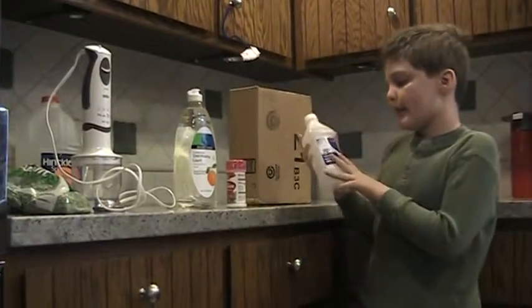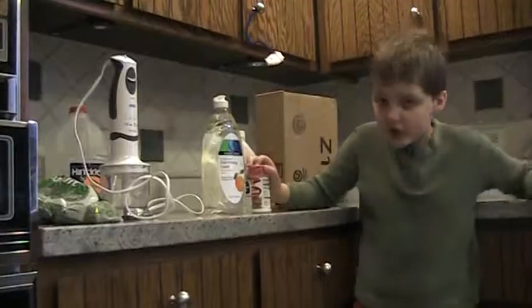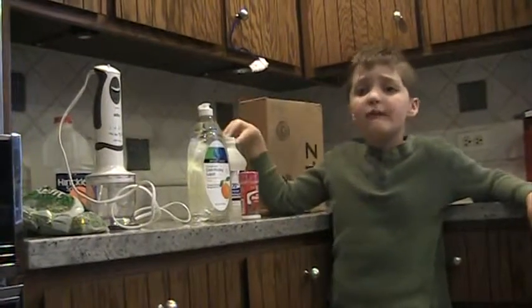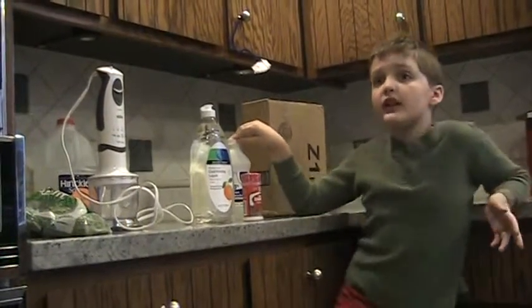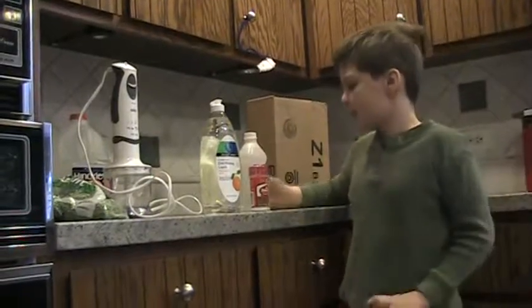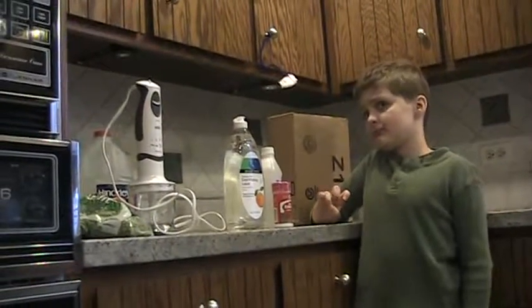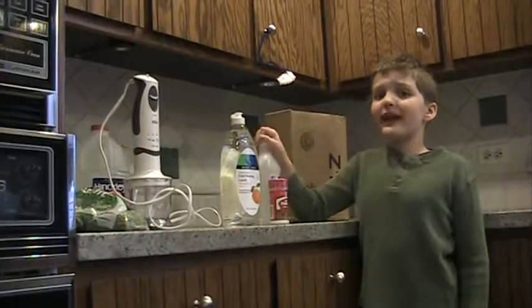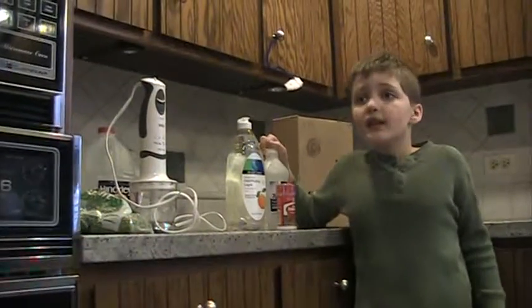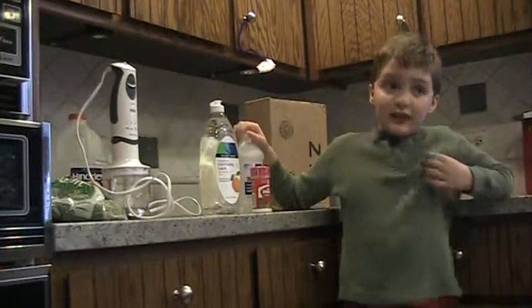Alcohol. Add rubbing alcohol to the pea soup mixture. Since the pea soup is denser, the alcohol forms its own layer above the pea soup, just like water and oil. Now, if you look closely at the place where the pea soup and rubbing alcohol meet, you can see some sort of white stringy stuff. Not exactly a scientific word, but that stuff is actually real pea DNA. And now you have your own pea DNA that you can keep in your own test tube if you want.